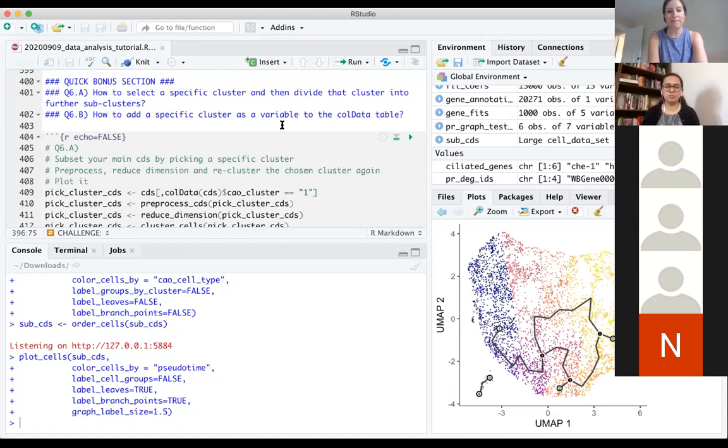There's a setting called set seed that you can set to something like 1, 2, 3, 4, 5. It's a random number generator. When you're doing analysis, you're not going to do all of it in a single day. So when you come back to it, people have had slightly different or varying results every time they try to do an analysis. Some steps in the analysis have random number generators, which give you slightly different results every single time.